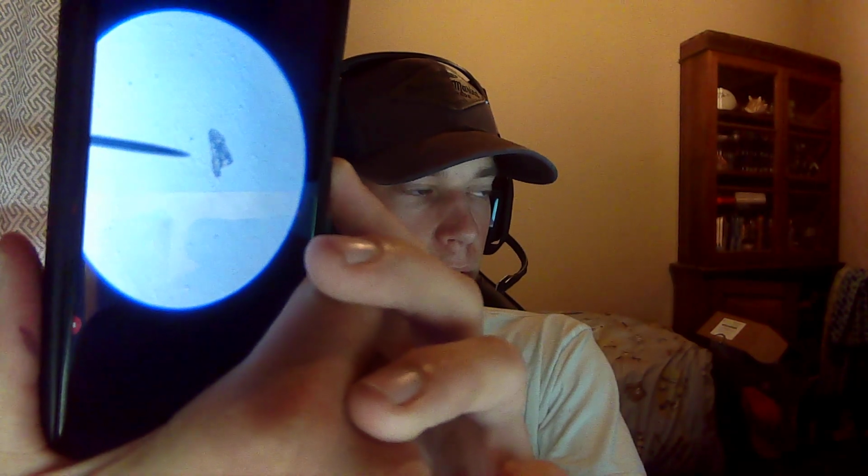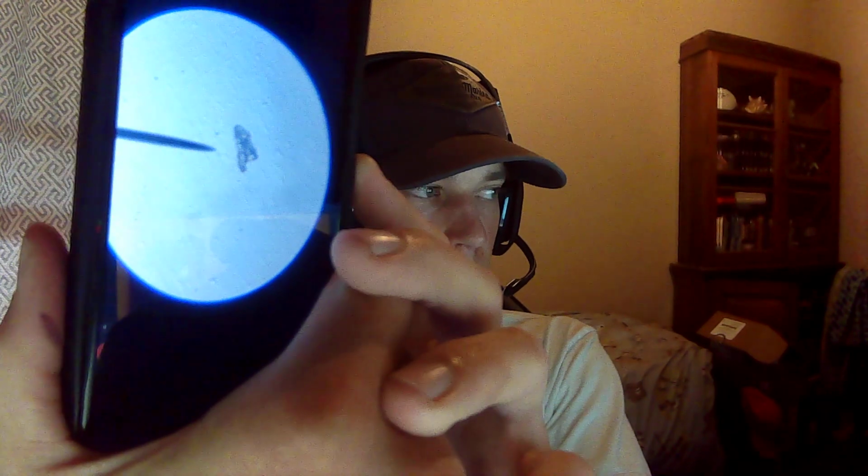As you can see, there is one big spot in the center, and then you can see diagonal lines running through it. The big marking in the center is the spirillum, and spirillum is a bacteria, but it's in a certain shape.